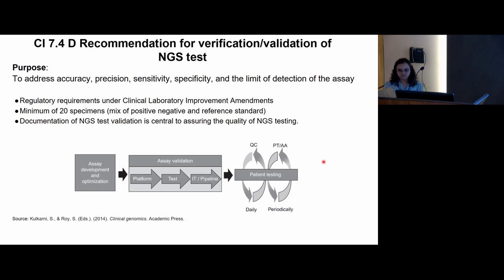But basically, I think the good idea is to go individually with the codes rather than just looking at aggregator software, right? Whatever they are saying, we kind of go with that. It's a good idea to use that, but at least what codes they are providing, we should check them individually and then take a call on what it is as a whole. If you think this is VUS, you should go with VUS. If you think according to ACMG it's pathogenic, you should go with pathogenic. And if that gene is important in that disease, then it automatically becomes either tier 1 or tier 2. The moment you have decided that it is pathogenic, it could be tier 1 and tier 2.